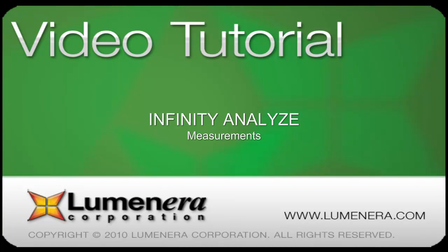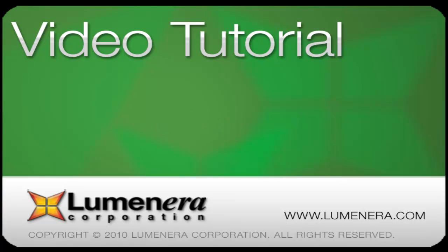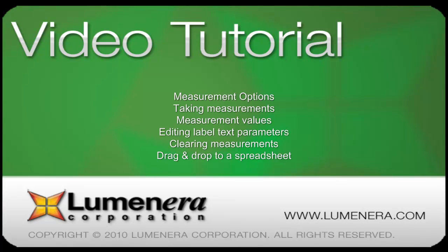This is part of the series of tutorials that provides an overview of the Infinity Analyze capabilities and features. Infinity Analyze provides a variety of controls and tools for extracting measurement information from captured images. This tutorial covers the setup of measurement options, taking measurements from a captured image, the presentation of the measurement values, editing text labels, clearing measurements, and exporting measurement data into a spreadsheet.